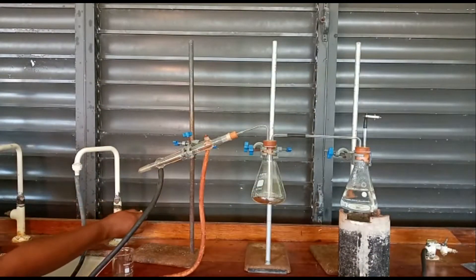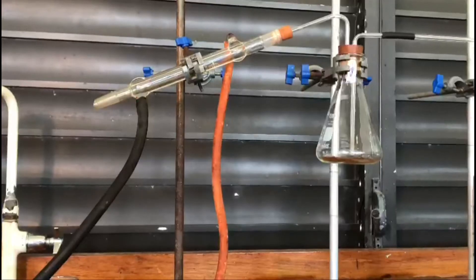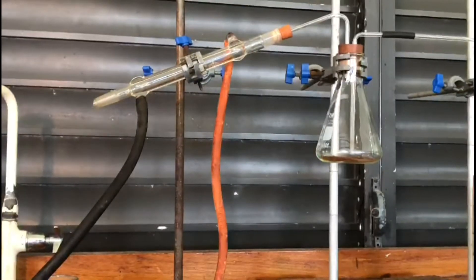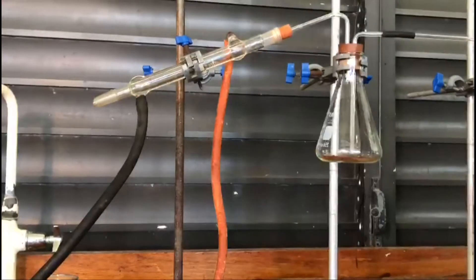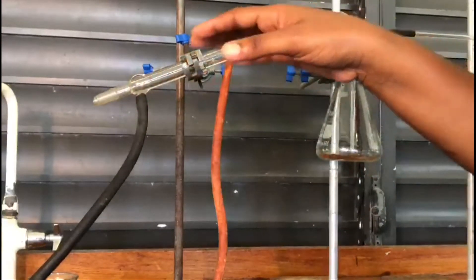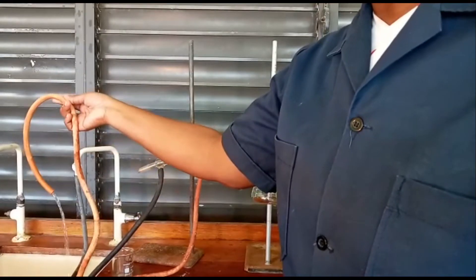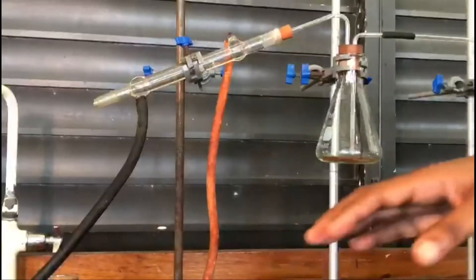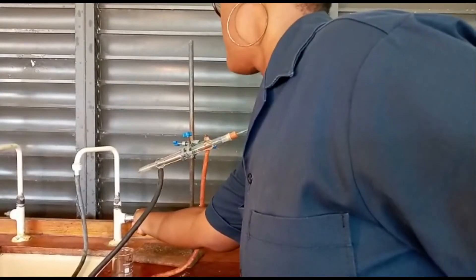I'm going to turn on the water so that you can actually see the water filling the condenser. As the condenser fills, you would have noticed some bubbles making their way up. The orange one is the water out — water is leaving, and water would have entered this condenser and made its way through.